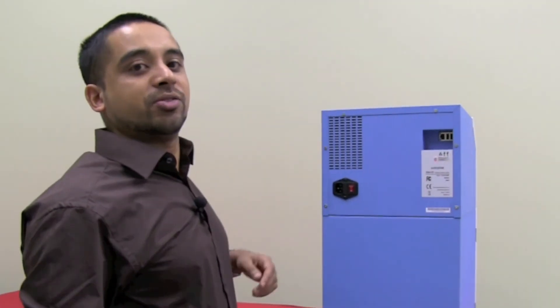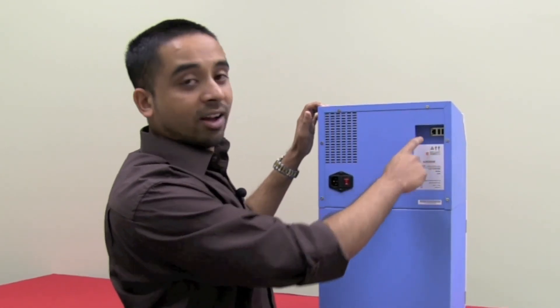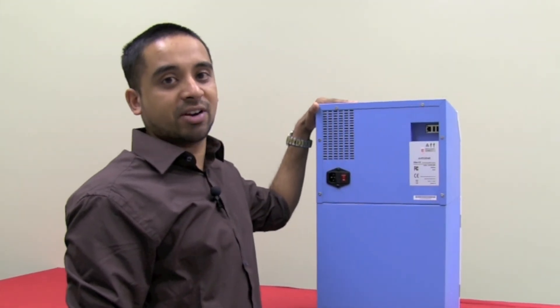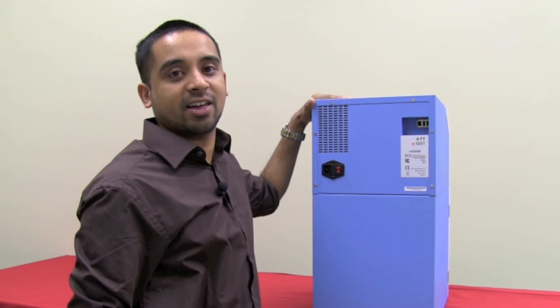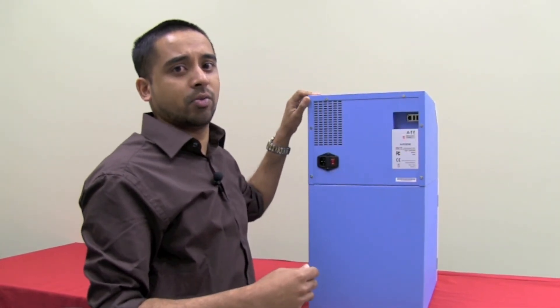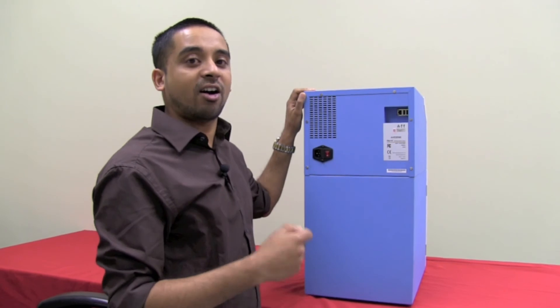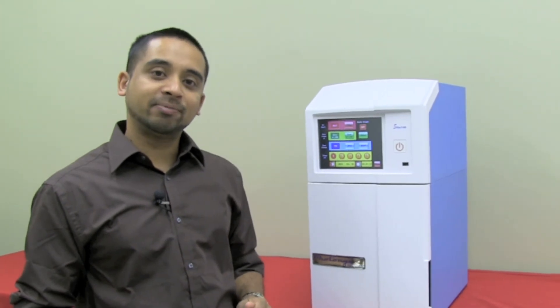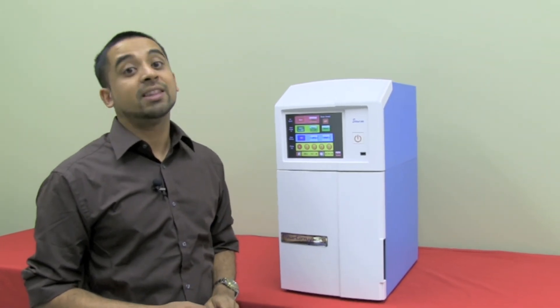Taking a look at the back of the instrument — it's really quite simple. We've got our computer connections here. The system runs on the embedded Windows XP operating system, which allows for network connectivity and two additional USB ports for connectivity to printers and other peripheral devices. When I first saw the location of these ports I thought they might be a little out of the way, but if you're going to have a network connection or peripheral devices hardwired, you wouldn't be fiddling with that very often. Additional filters are available for this instrument, as is an optional printer. Although the built-in software is very good, further software is also available if you require additional manipulation of your gel samples.